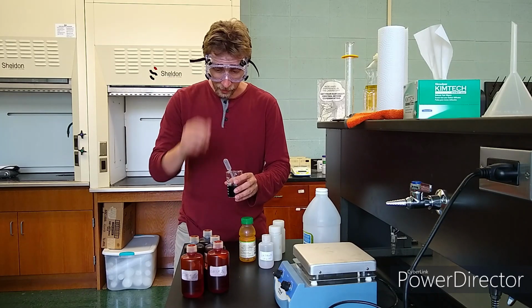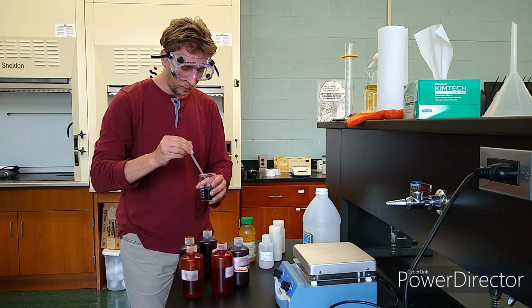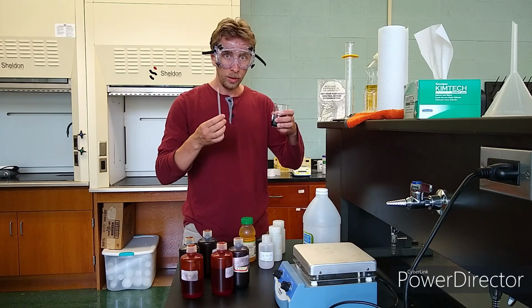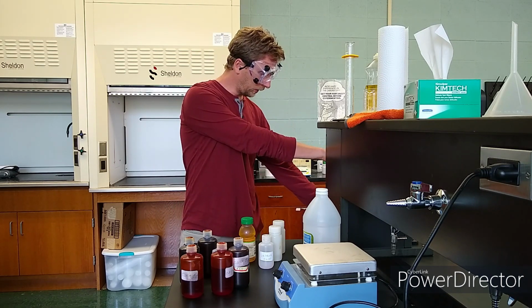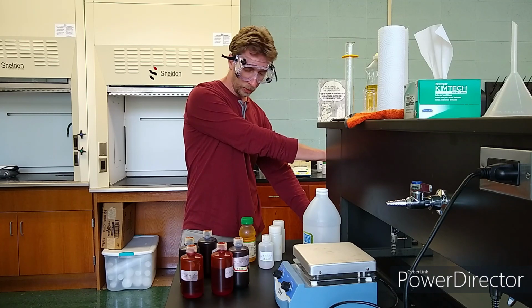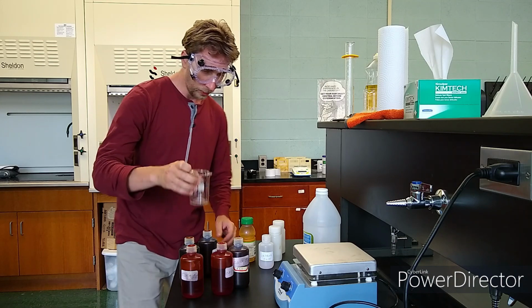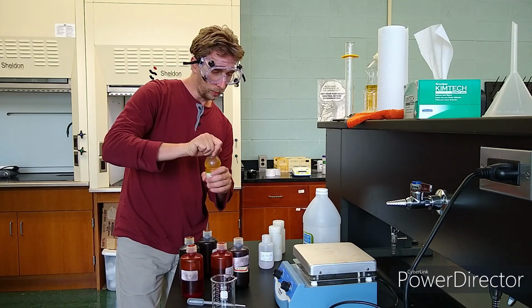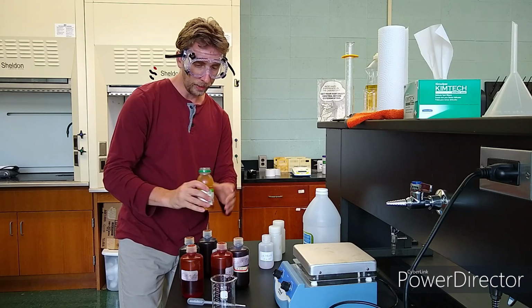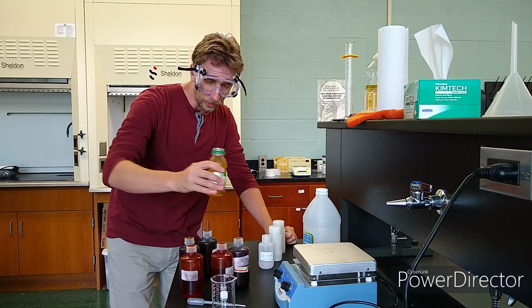Alright, so let's check the iodine solution that we might use. Down the drain with the starch check. Don't need that for anything at the moment. All I need to do for the check, well, easy way to do it, I'm going to do it like the actual experiment will be set up. That's basically what I'm going to do.